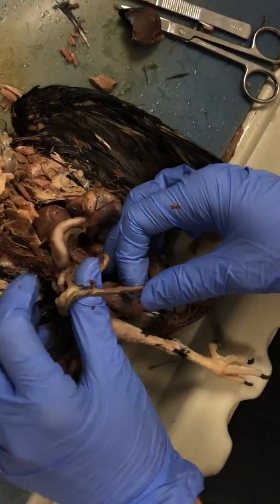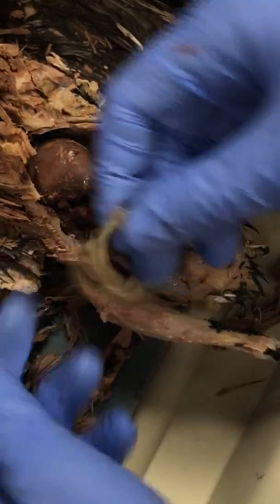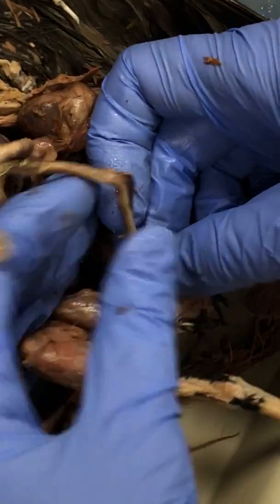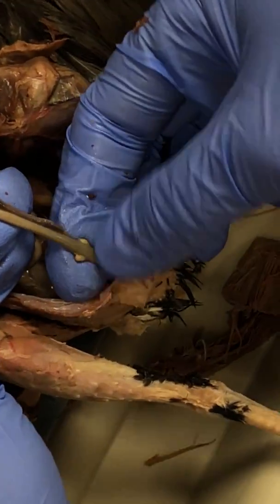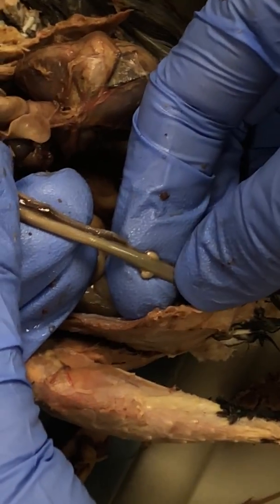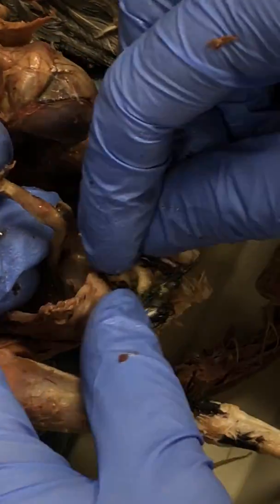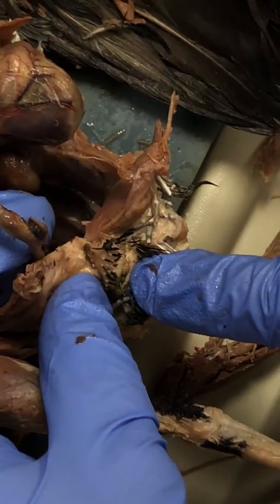When we follow all of these intestines to the end, we get to the end region right here. These two small, round structures are going to be the ceca, and eventually the waste is going to exit out the cloaca, which is this opening right here.